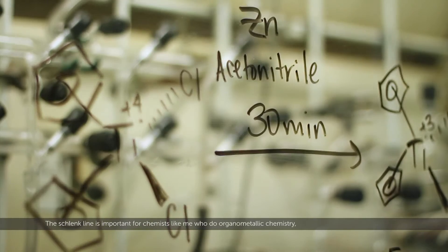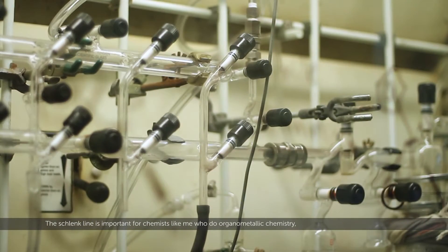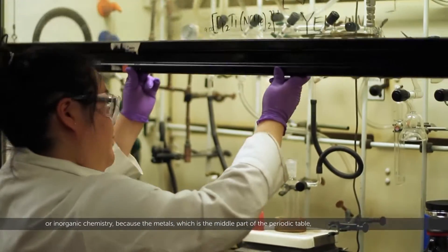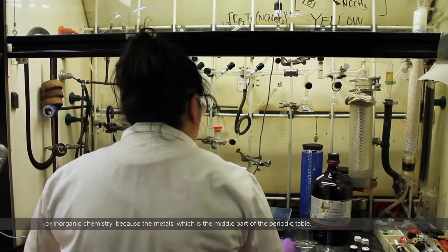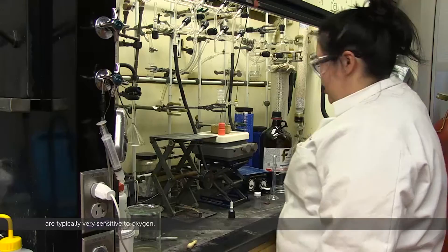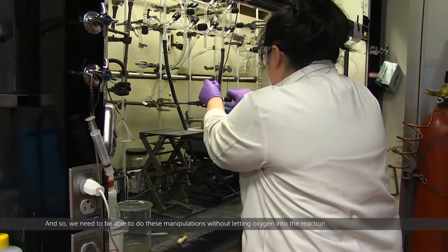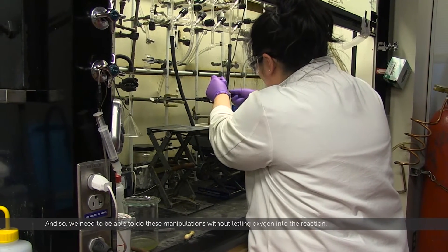The Schlenk line is important for chemists who do organometallic chemistry or inorganic chemistry because the metals, which are in the middle part of the periodic table, are typically very sensitive to oxygen. We need to be able to do these manipulations without letting oxygen into the reaction.